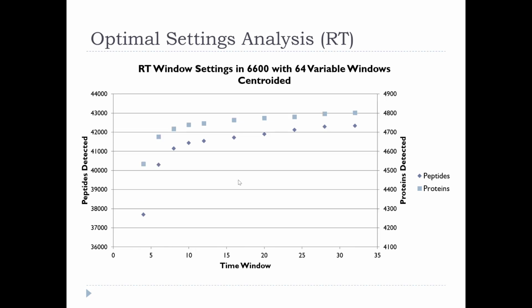And then the question of the time window, we talked about plus or minus 5 or 10. I did an analysis of that, and that was pretty interesting too, because I was expecting that to go up and then come down as I got really wide time windows, but it doesn't. It actually levels off and then continues to go up. That's because we use a dynamic model. As the window gets wider, retention time becomes a stronger and stronger score, because all the random things start moving away from the true retention time. There's more random space for retention time to impact. So this isn't just adding false discoveries.